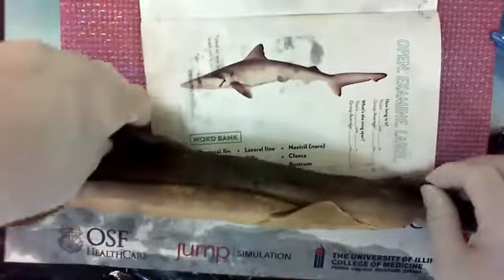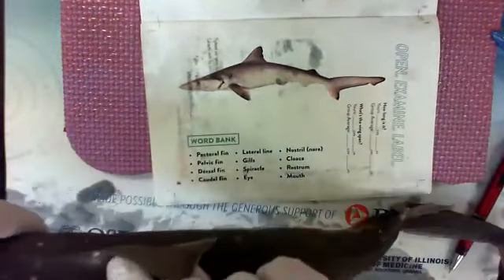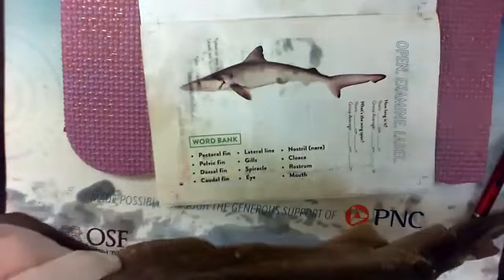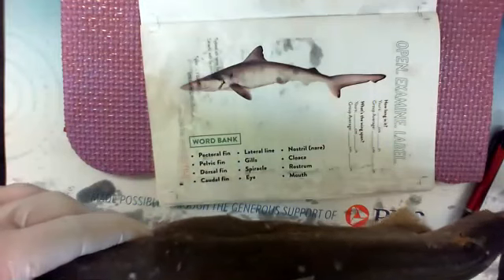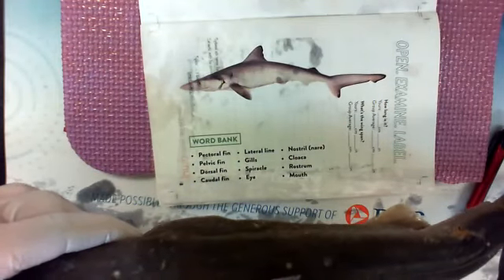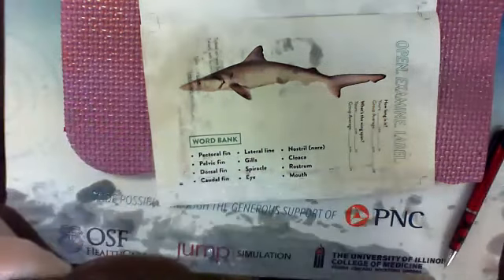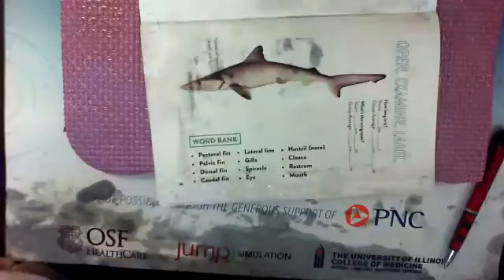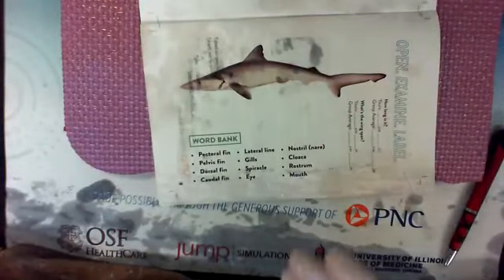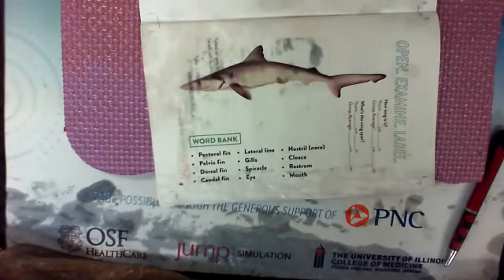And remember how I told you the dorsal fin was missing something? See how that's been cut? And that's been cut? You can usually, you might have to look down a little bit, but in mine, you can see where that needle came out, that spine came out, and there's actually a little hole inside the spine with the toxin in it. It's not toxic to humans, it's toxic to other fish, but if they left it on there and it poked in your finger, it'd make it red, irritated, itchy, and burn. Ugh, gross.